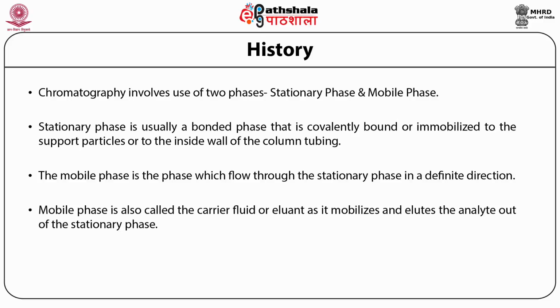and is separated. Because the different components of the mixture adhere to the adsorbent with varying degrees of strength, they also migrate different distances through the adsorbent as the eluent flows through it. In other words, the components that adhere more strongly to the adsorbent travel more slowly than those with weaker adhesion. In effect, this process separates the various components of the sample mixture into individual compounds that can be further analyzed.